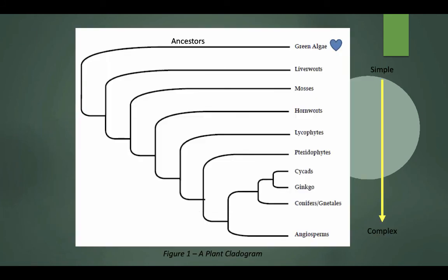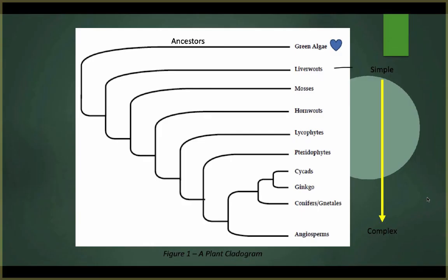So essentially what we're looking at here, we're going to begin with these most primitive land plants, the seedless non-vascular plants. And we are going to work up to the most advanced and dominant form of plant life that we always think of when we think of plants, the angiosperm. Now, you can see here are the very simplistic, more primitive land plants. Probably shouldn't say simplistic, just different and more primitive.